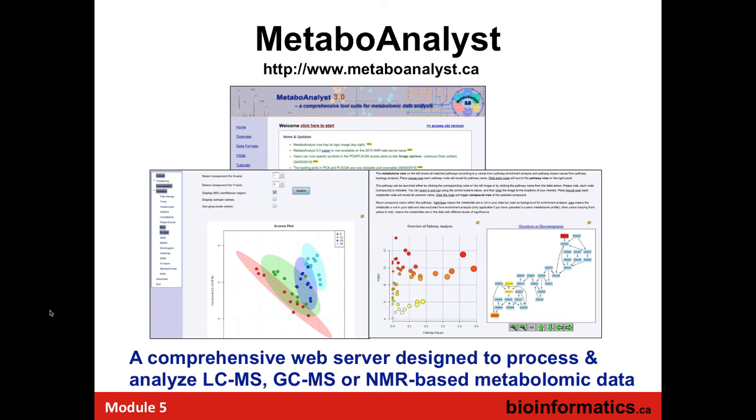So what it does is it's a web server, and that was the novel part about it. It took metabolomics analysis out from having to have custom software that you paid lots of money for, and it put it online. And the second thing it did was it made it very easy and very visual. It's also very general. It works for LC-MS and GC-MS and NMR. It's particularly suited for targeted metabolomics, but you can put any type of data, including untargeted data, into MetaboAnalyst, and it'll work.